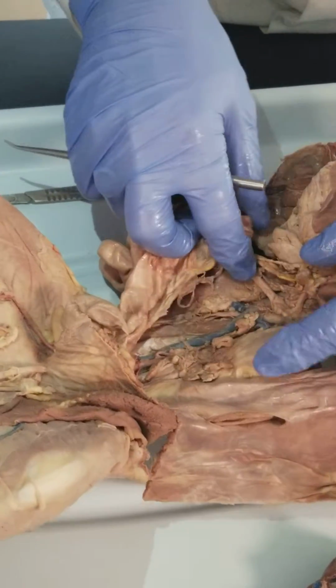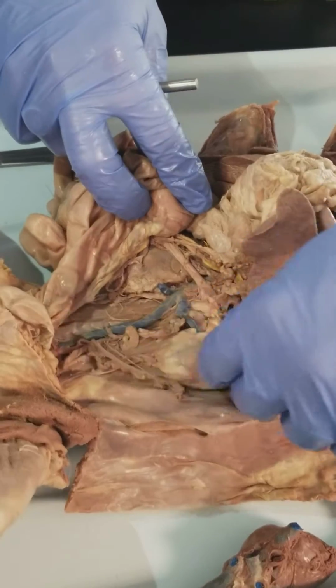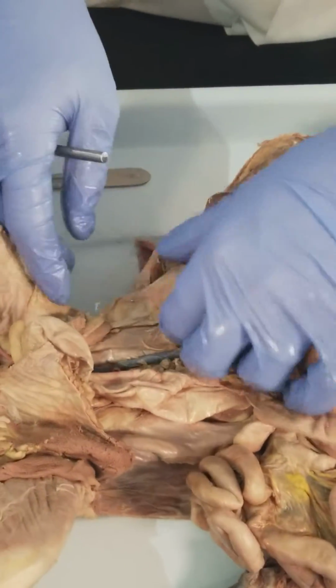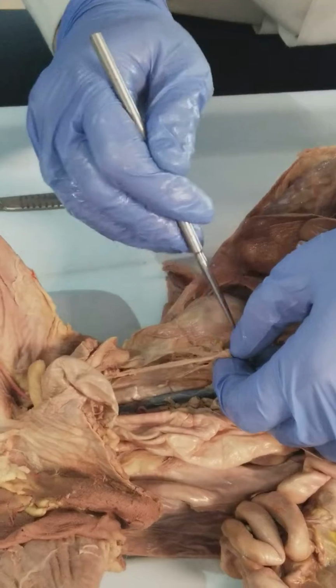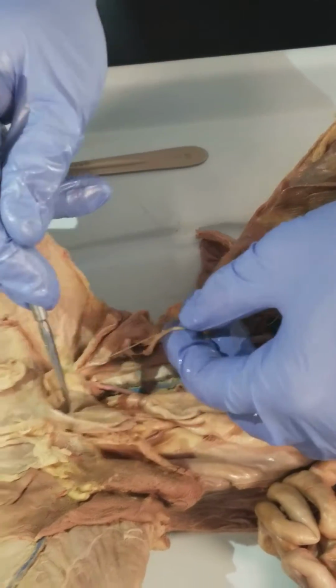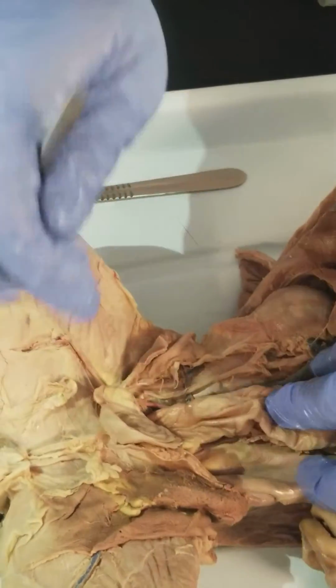For the urinary system, we've already probably located the kidneys, right? We did that pretty early on in the semester. So here's our kidneys here, and the other one is over here. Associated with these, you should see ureters coming off of them, and that's what you can see right there. So there's a ureter, a nice little ureter tube going in there. If you chase this one, it's been severed a little bit, but this will actually connect to the bladder itself.